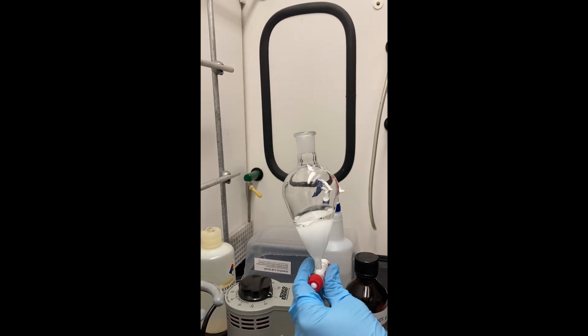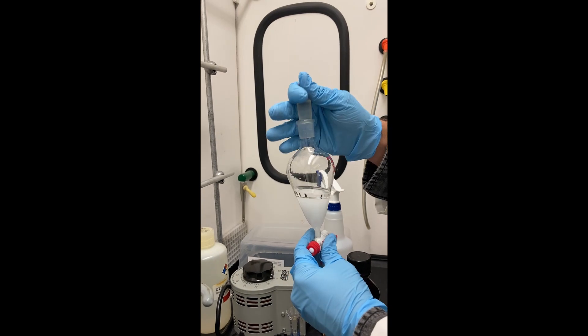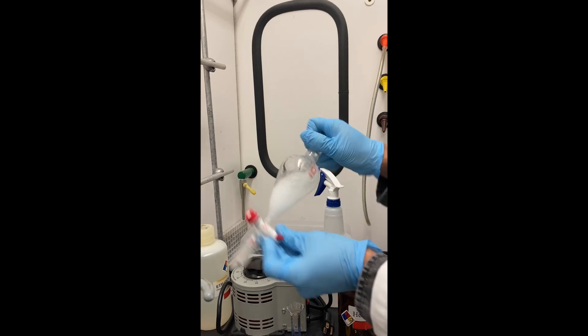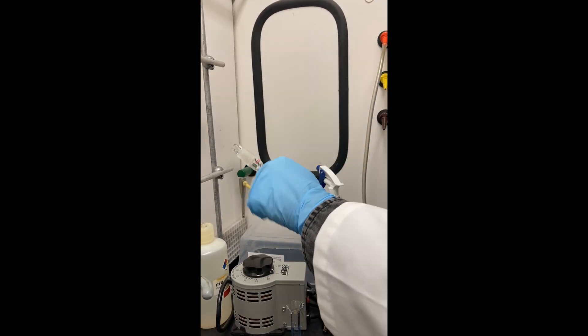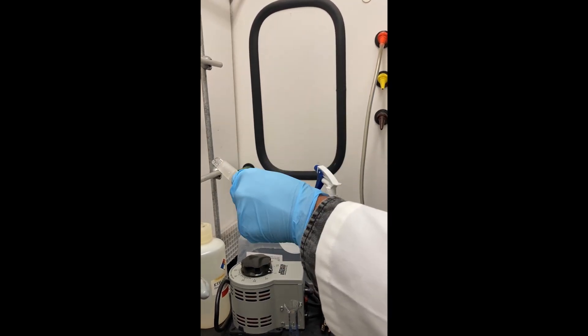For the next step, make sure that the stopper is attached securely to the separatory funnel and that you're venting the separatory funnel after inverting. This prevents a buildup of pressure which can cause harm to yourself or cause a mess. Notice how the separatory funnel is pointed away from the person using it and into the back of the hood.